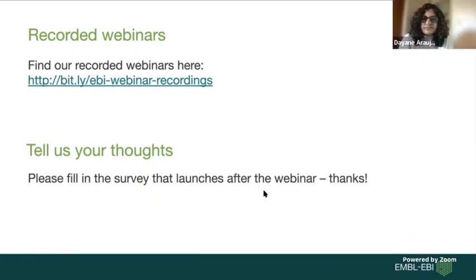Okay, who has the next most votes? Susan has a lot. What strategy do you recommend to segment image based on the color intensity?